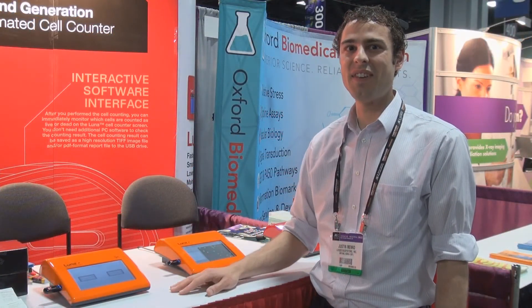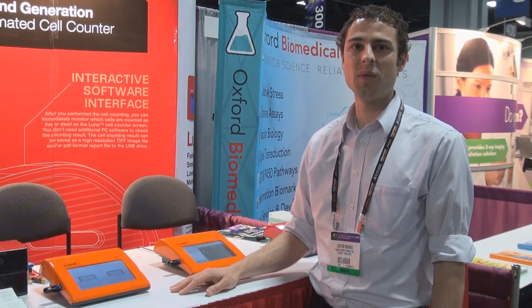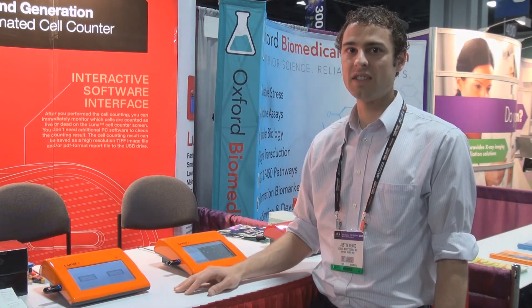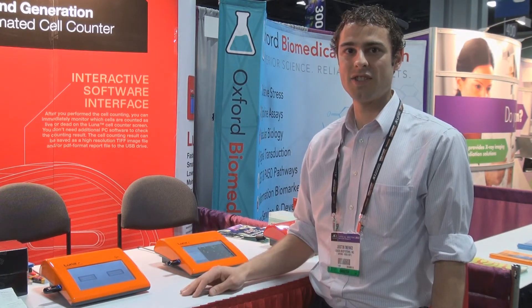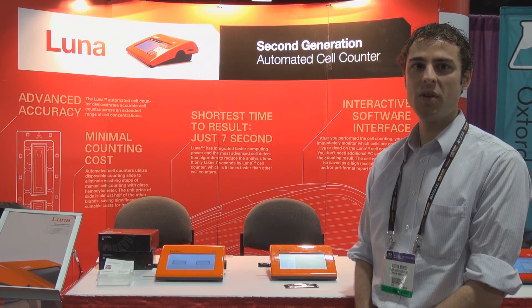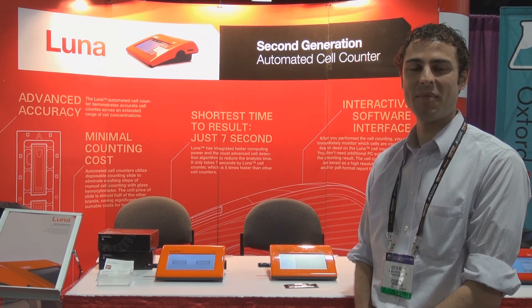In summary, the Luna FL is an automated cell counter without cell counting limitations. It can count blood cells, primary cells, yeast, and standard cell lines, all in one affordable package. For further information or to request your demo, you can go to logosbio.com. Thank you.